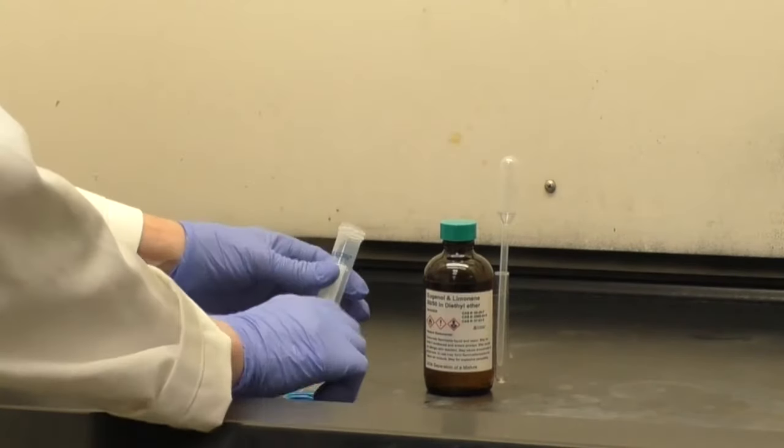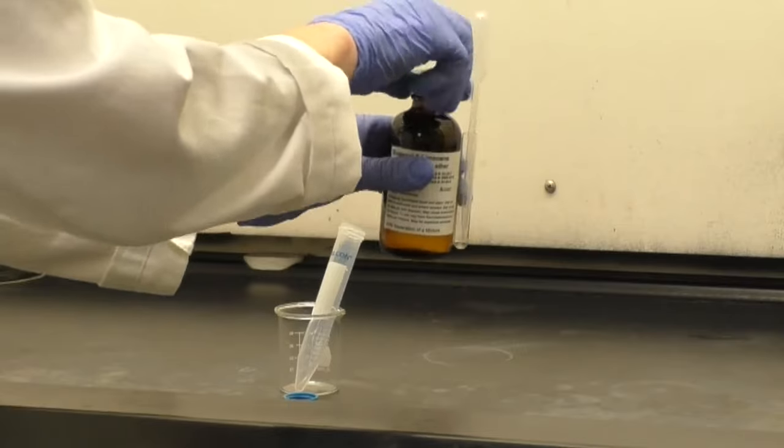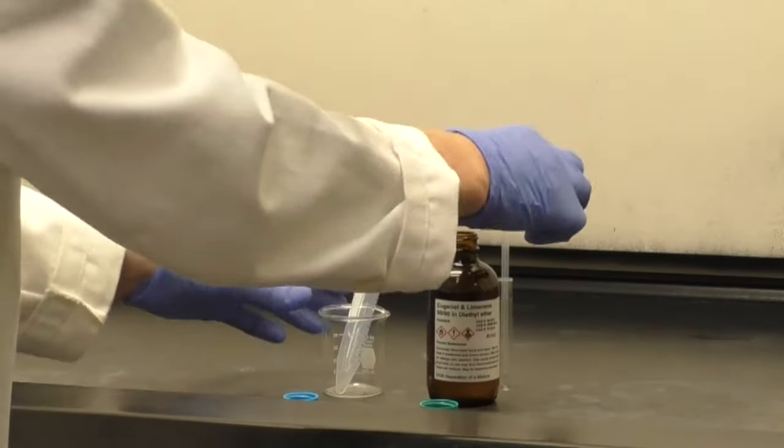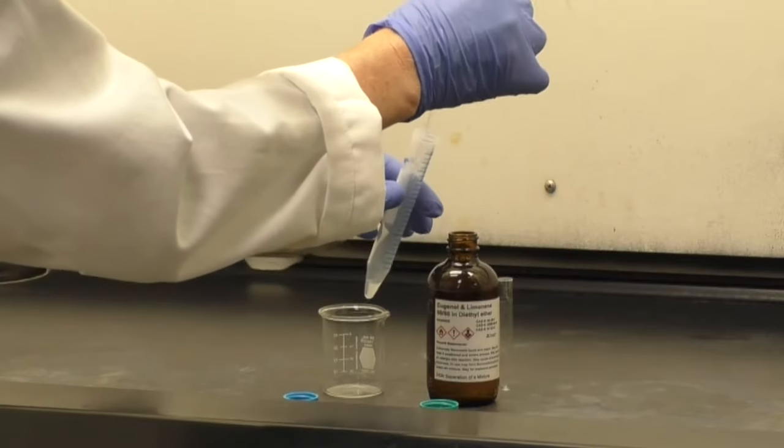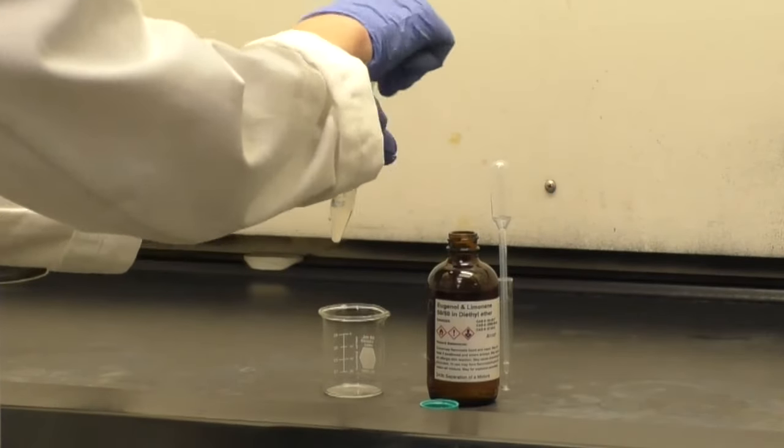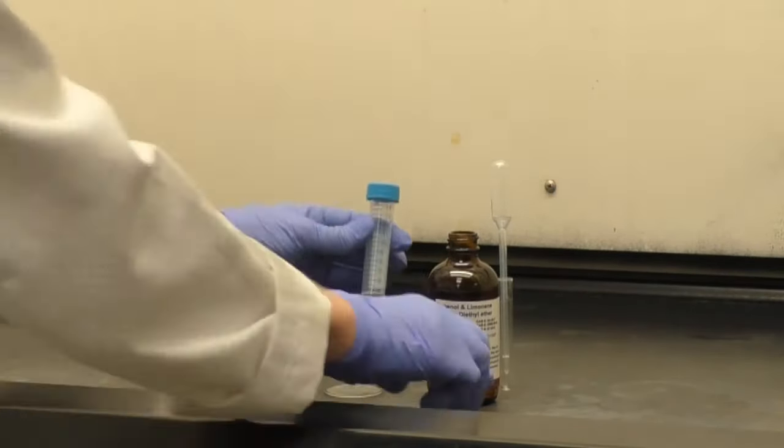To begin, put 5 mL of the solution into a clean, dry, 15 mL centrifuge tube. Use the graduations on the tube to measure your amount.